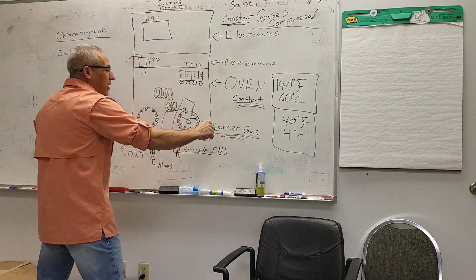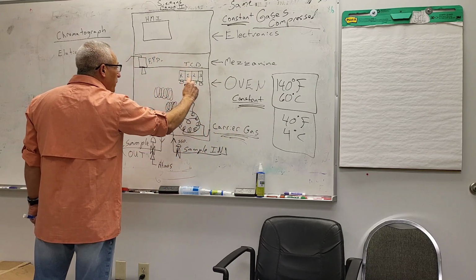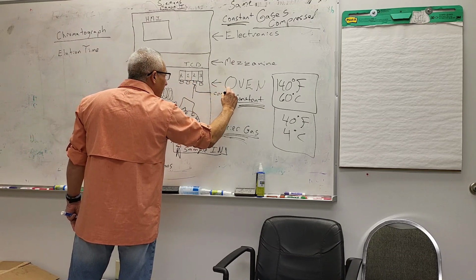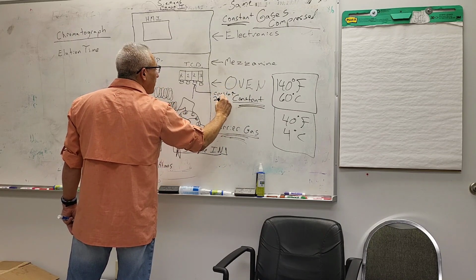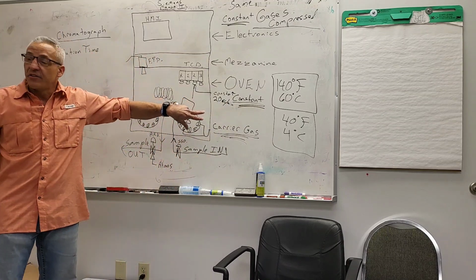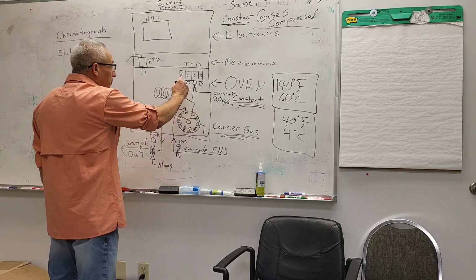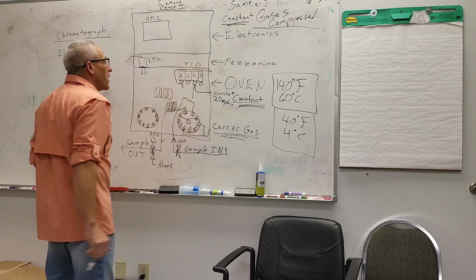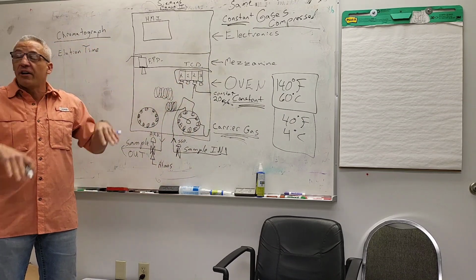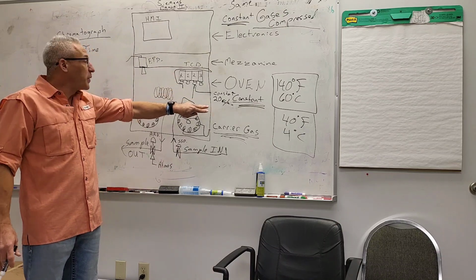When we get our carrier gas set, the flow coming off of our thermistor beads of carrier gas is going to be constant. So let's say we're going to set this to 20 cc's a minute. Once it gets set to 20 cc's, we set this flow. We're going to have a reference. Carrier gas is going to come in, go across the reference, and go out. Reference against all the other beads, we're going to compare them, and we're going to get deeper and deeper into the TCD. But the main thing is that this flow is going to be a constant.